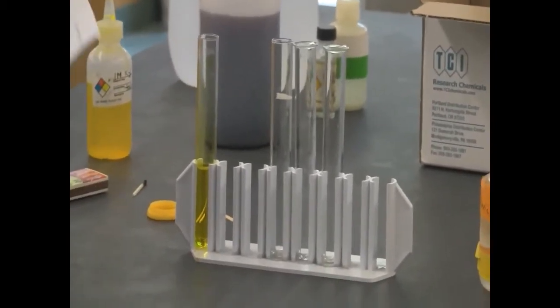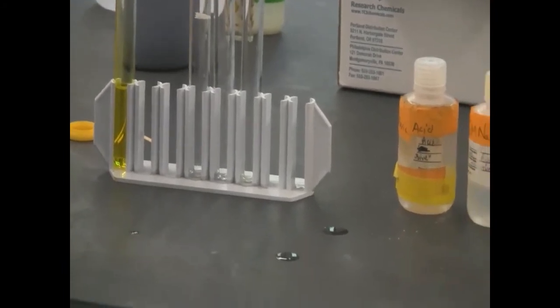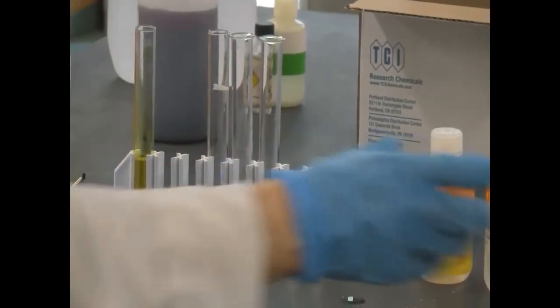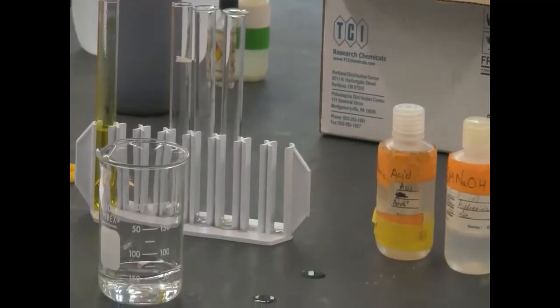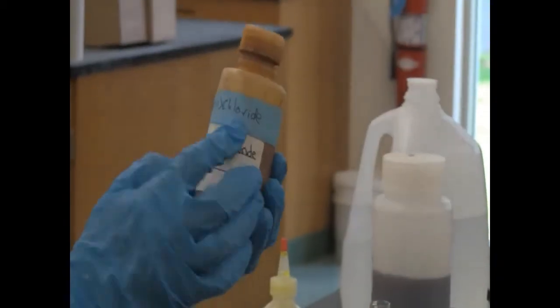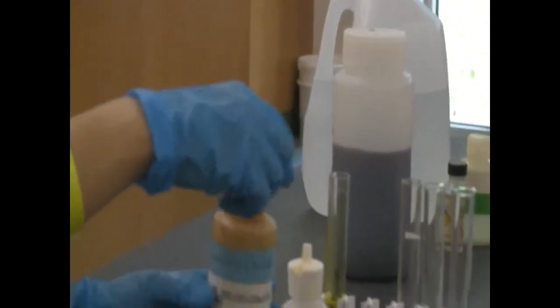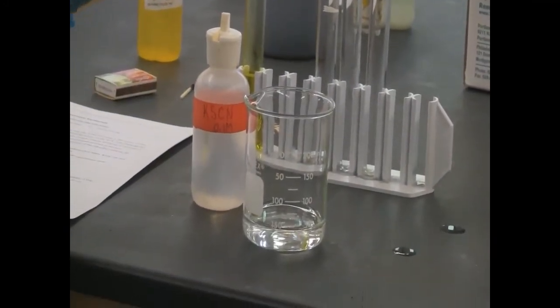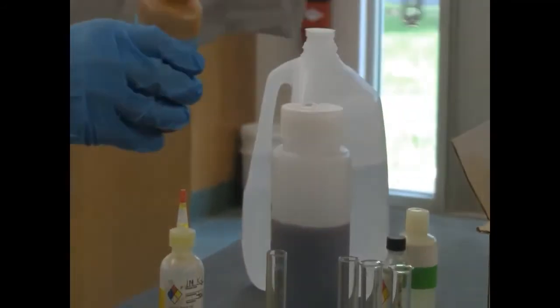Part F will check the iron 3 chloride and iron 3 thiocyanate equilibrium. So first we need to have the equilibrium set up. So we need to add the thiocyanate, SCN, ion, and the iron 3 chloride into the solution. We develop the equilibrium. So you can first take a look at the color of them. Let's check the color. Maybe I'll put this in the test tube first for you to see the color of it.